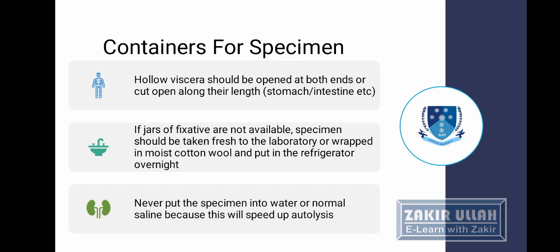One thing we should do is that we should never ever put a specimen in simple water or normal saline, because simple water or normal saline provides a good environment for the bacteria or microorganisms which cause degeneration and autolysis of the specimen. So therefore, we should never put any organ or any tissue in water or normal saline which is diagnosed or which is transferred to the histopathology laboratory for a histopathology report.